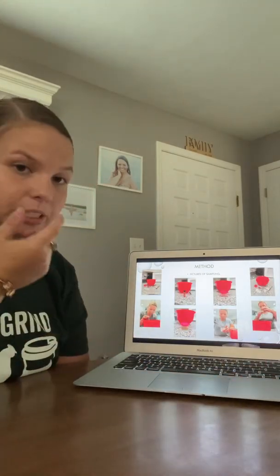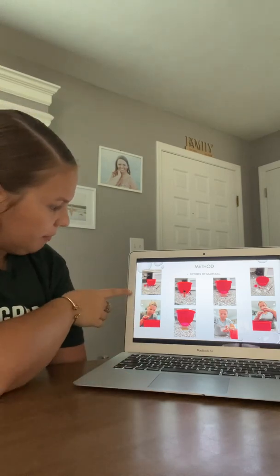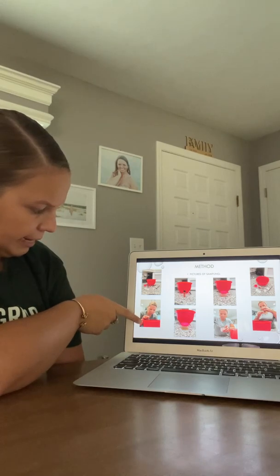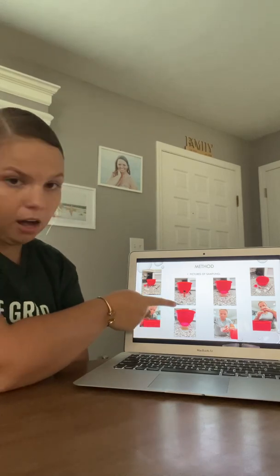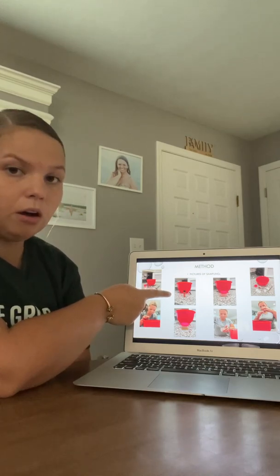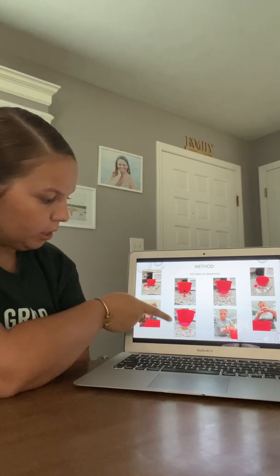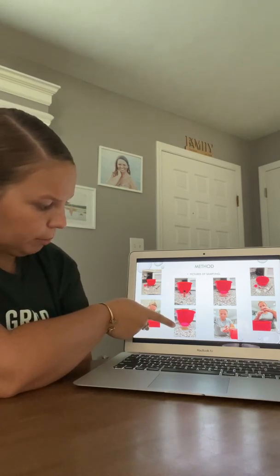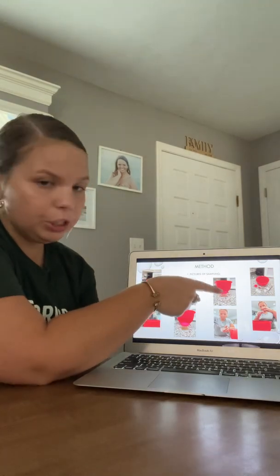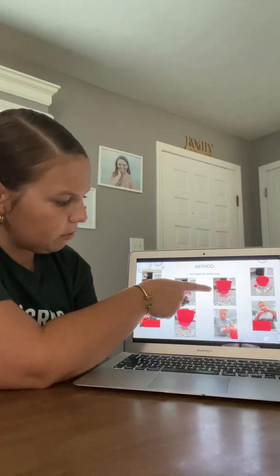These are just some pictures of my sampling. So this one in the top left is just the materials that I used. This one right below it is me testing the temperature of the water. This one right here is just one of the results of one of my dissolved oxygen samples. This one below it is the result of one of my pH levels. This one to the right is the results of the nitrate levels.